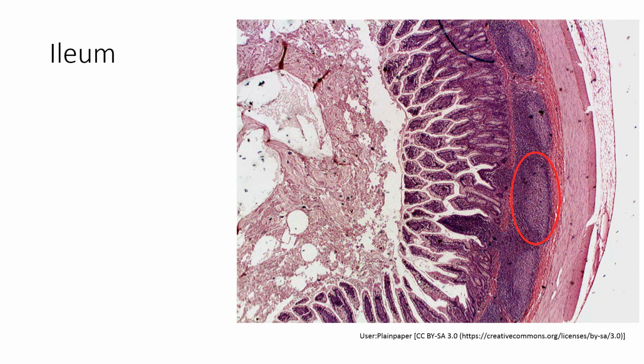In the submucosa of the ileum, we see these structures circled in red in the micrograph on the right, and these are called Peyer's patches. Peyer's patches are lymphatic tissue. These are full of macrophages and lymphocytes, immune cells, that can take care of any bacteria that make it across this epithelium. Remember, out here, this is external.